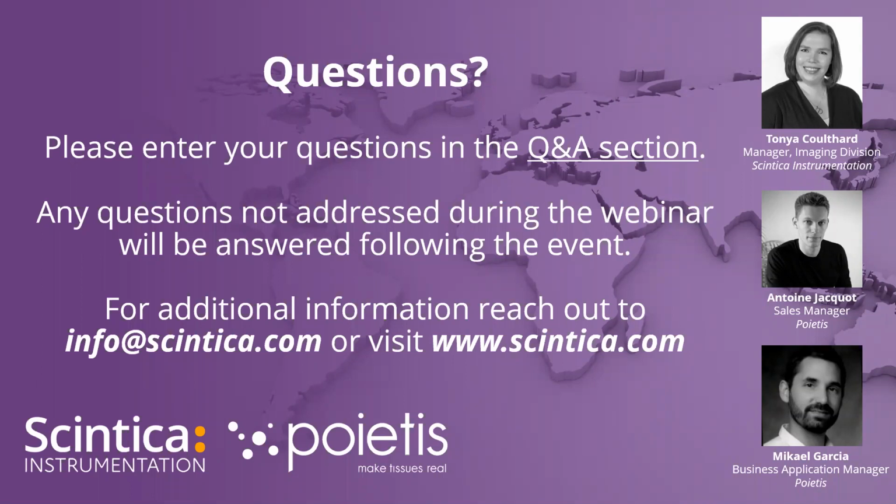We didn't show the slide, but I do invite you to look at the first or second webinars. My colleague has placed the link in the chat box for all of the attendees. Basically, you saw the metallized substrate that the media with the cells was spread across. That sits on top of the laser head, and the laser is shone up from underneath as it hits the metallized substrate, which is a glass substrate. Energy is released, and that allows a droplet to be released from that media layer, shooting upwards towards the plate that you're printing onto. As we saw in the video, that plate is flipped upside down quickly for that to occur. So the media jet goes upwards and prints the pattern onto the plate that you're printing onto.